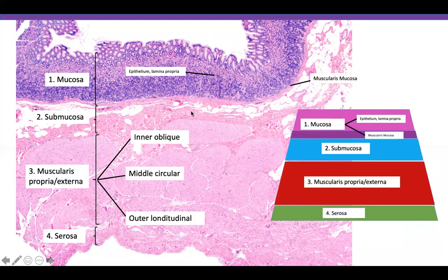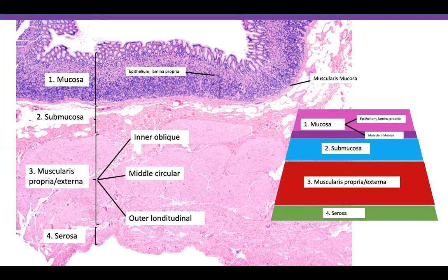The submucosa also contains lots of blood vessels and lymphatics. The muscularis propria in the stomach is comprised of three layers of muscle. In most other parts of the GI tract you have two layers — middle circular and outer longitudinal — but in the stomach, because of churning of food, there is an inner oblique, middle circular, and outer longitudinal muscle layer. The serosa is the outside of the stomach.